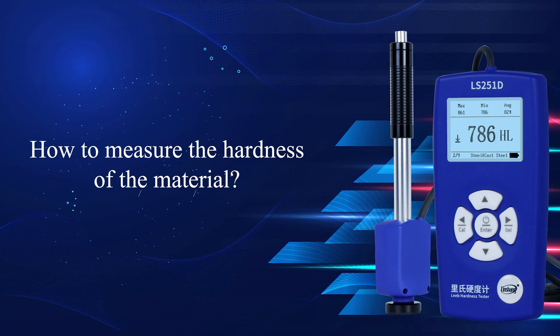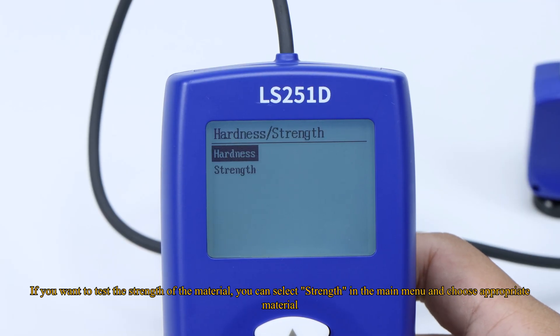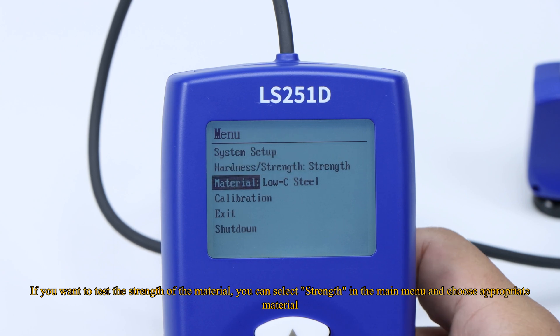How to measure the hardness of the material. If you want to test the strength of the material, you can select Strength in the main menu and choose the appropriate material.